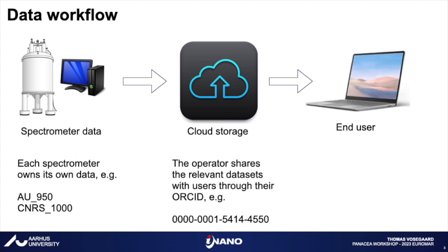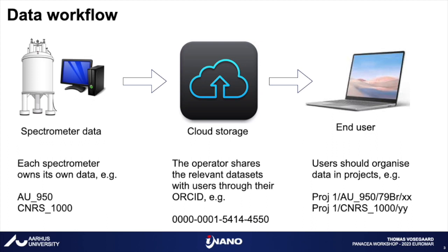Now, the overall workflow is that the spectrometer owns the data, it pushes the data to the server, and it's tagged with the spectrometer name. And then at the server, the operator shares the data with users through their ORCID. And this means that the end users, or the clients of PANACEA, can access the data and organize it into projects. So that's the basic workflow.